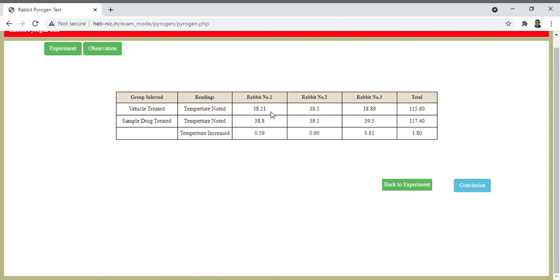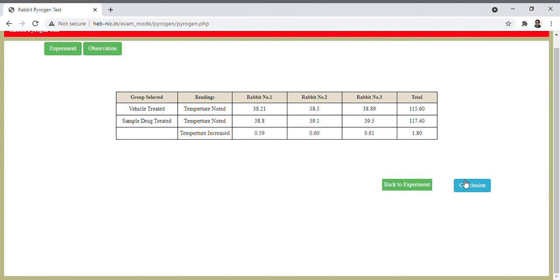In the first rabbit, in the second rabbit, and in the third rabbit, the total temperature raise is 1.80. So with this we can make the conclusion whether our test passes the pyrogen test or not. Thank you.